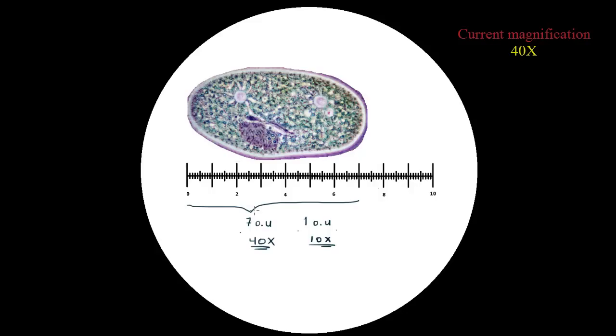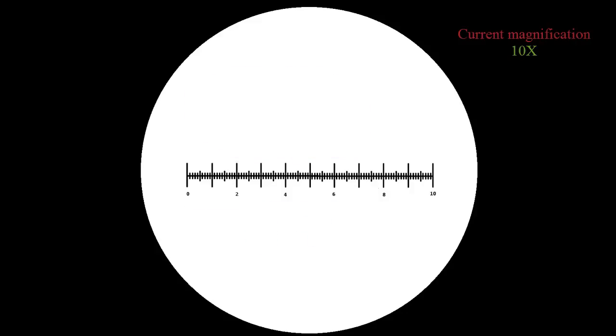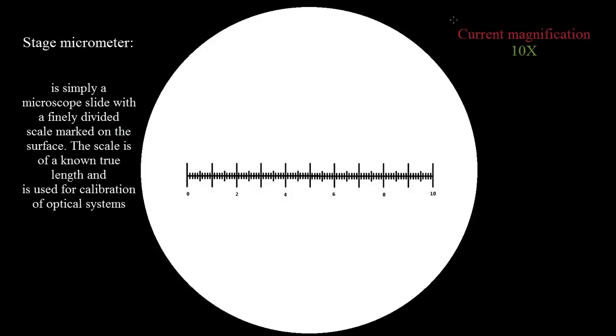So by now it should be clear to you why ocular units don't actually mean anything unless we calibrate the microscope. So how do we do that? In order for us to start calibrating our microscope we will need something known as the stage micrometer. What is a stage micrometer you ask? Well a stage micrometer is quite simply a factory made one millimeter unit that you can load onto your microscope stage, and that's what I'm going to do.